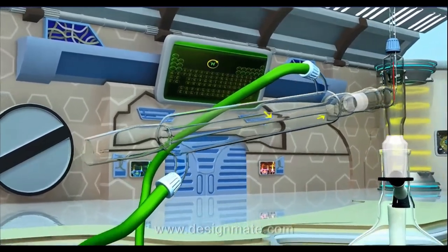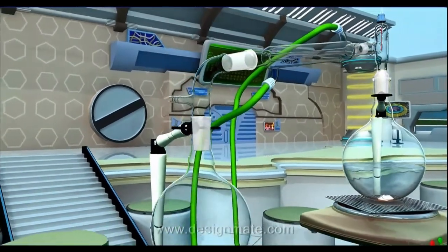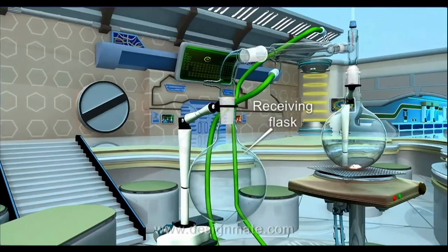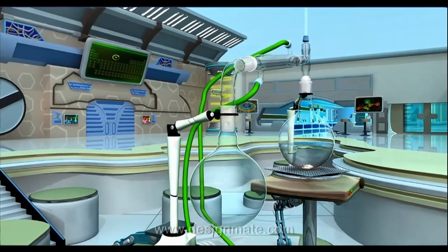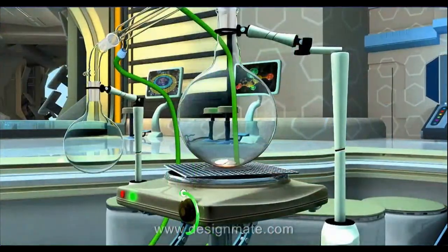Join the other end of the condenser to a vacuum adapter. Now, attach another RB flask, called the receiving flask, to the other end of the vacuum adapter. Now that we have assembled the apparatus for simple distillation, let us start the process.